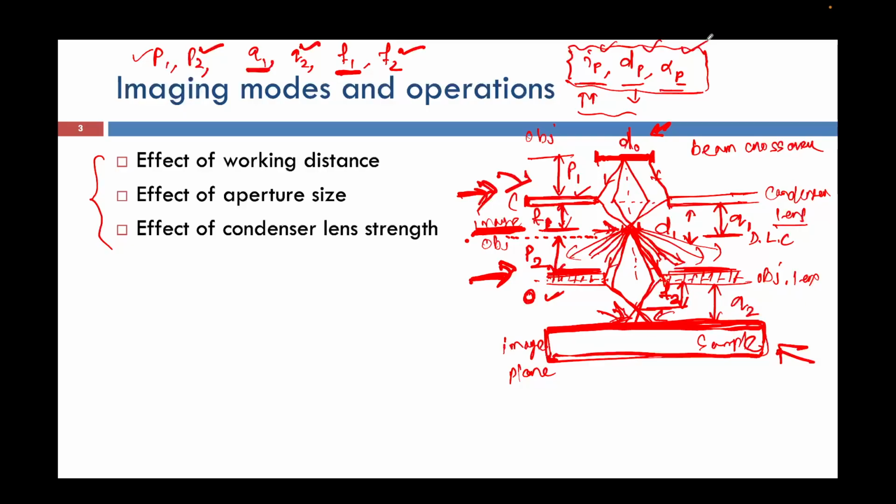In the ideal case scenario, F2 might match with Q2, right? Yeah, F2 here I have put. This is the F2 and this is the Q2. So F2 is this one. This plane is the focal length. So this is the F2 plane and this is the Q2. In ideal condition, F2 and Q2 should match.